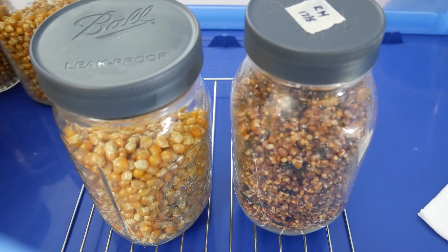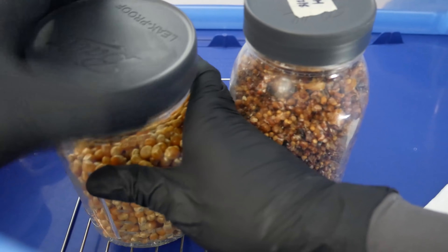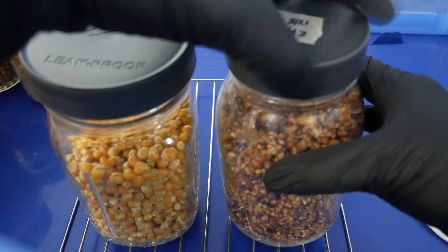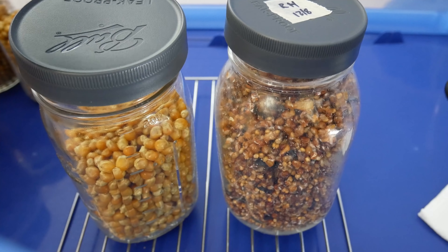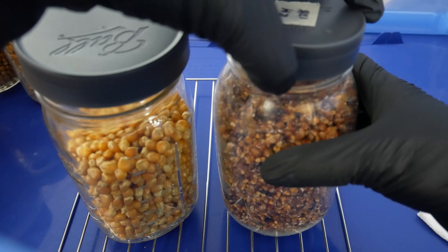Notice here I'm wiping down everything with isopropyl alcohol to make sure I sanitize everything and keep things clean before I start working. I'll go ahead and loosen up both jar lids and get ready for the grain-to-grain transfer. We want to minimize the amount of time these jars are exposed to open air, as this could introduce contamination, so work quickly and efficiently.